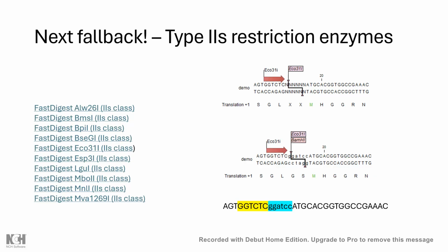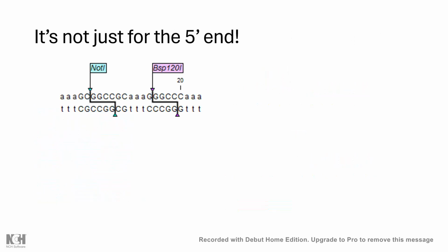So trust me when I say this has saved my bacon more times than I care to count, and it always brings a smile to my face being able to do this kind of stunt. And as ever, I've been leaning into BamHI and neglecting NotI. But here's the cut. Sorry, forgot to say that. There's your pretend sticky ends, which will lovingly mate up with your insert.